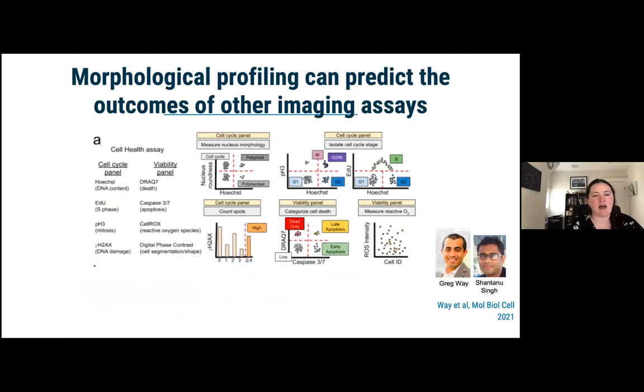We don't have a way to do that in CellProfiler. With CellProfiler, we typically are not usually making classifications. There is a classify objects module, and there are ways to do classification in CellProfiler, but typically we think of CellProfiler as making the measurements, and the assigning into phenotypes we almost always do downstream. But there are ways, if you use tools like CellProfiler Analyst, to do that sort of classification, bring that back to CellProfiler and keep applying it to future data sets. But healthy is going to look a little bit different in every situation, and so you'll have to train your own for your cells.